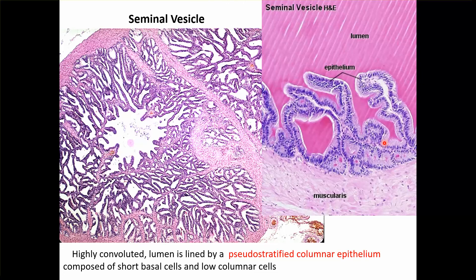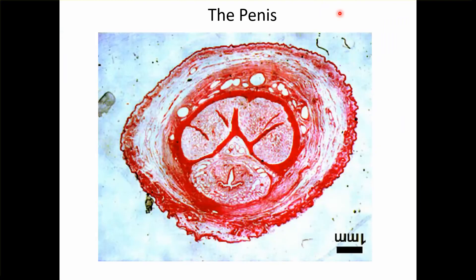Now the penis. You can see that there are totally three muscular bodies. The corpora cavernosa on two sides and the corpora spongiosum with the penile urethra opening.